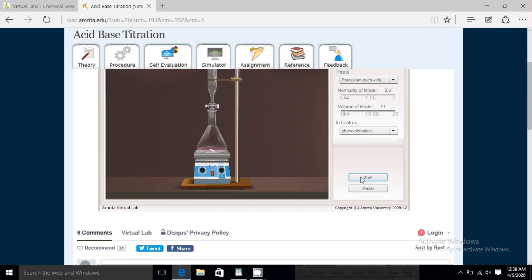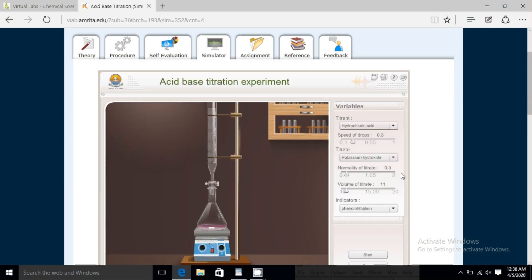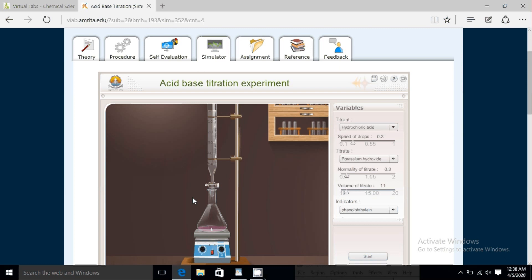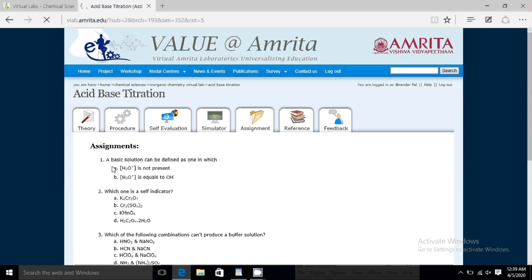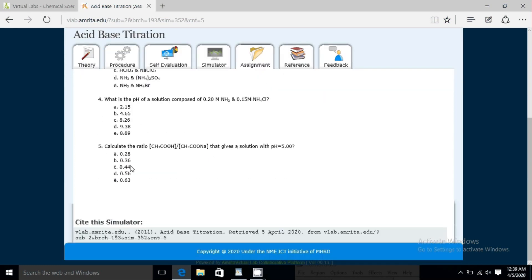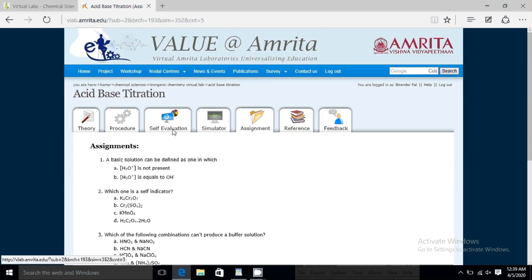Once you click Start, you can see that some drops appear and there are some reactions happening. You have to calculate all those reactions, similarly to how you would in your practical lab. The same way you have to calculate here, and then you note it down in your notebook.